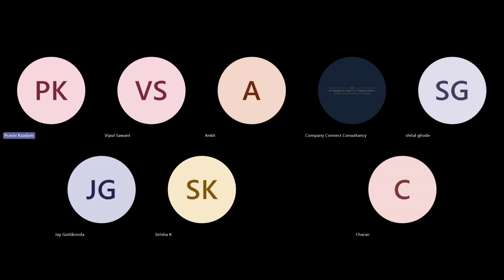Okay, so there are two different things we are discussing here. Result posting or result punching into SAP is totally different. This is the certificate of analysis and result recording. Your final COA, the certificate of analysis, is generated from SAP. So those results need to be transferred from LabWare to SAP, the QM module, and that is part and parcel of your integration.